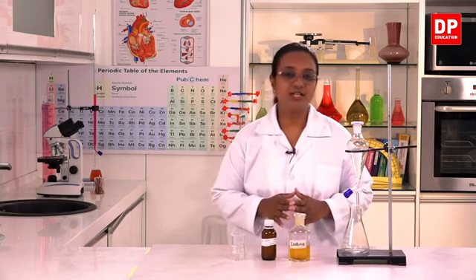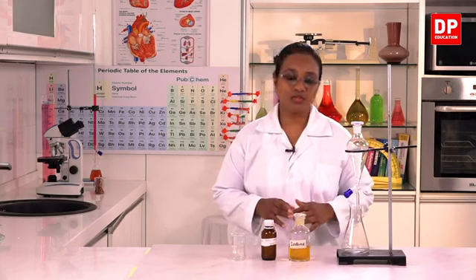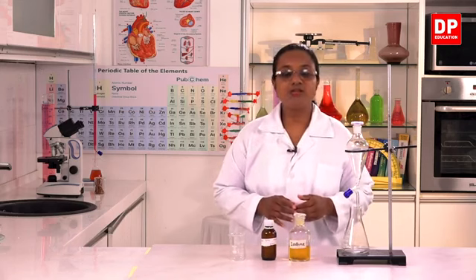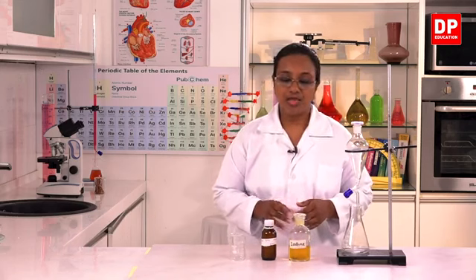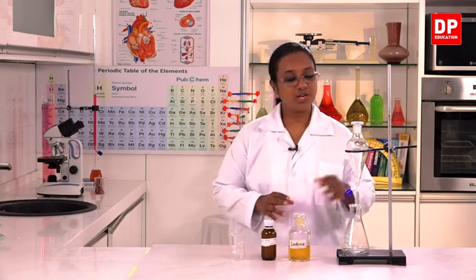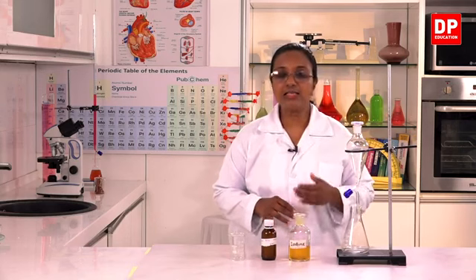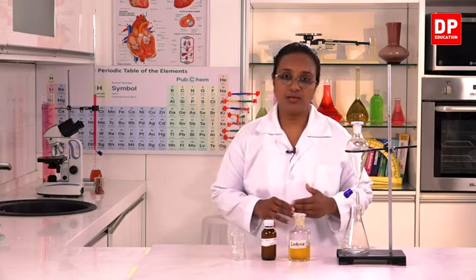non-polar carbon tetrachloride. And here you can see the color of the solution. It is light reddish brown in color. And here when I add some of the carbon tetrachloride into the separation funnel, you will see that it is a colorless solvent.